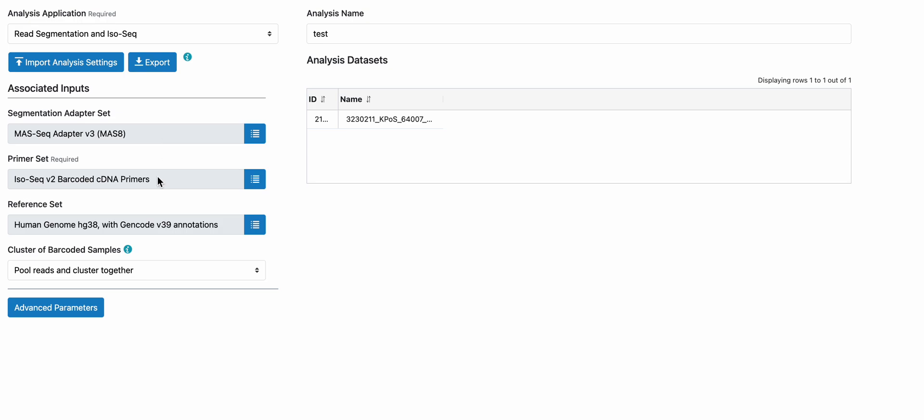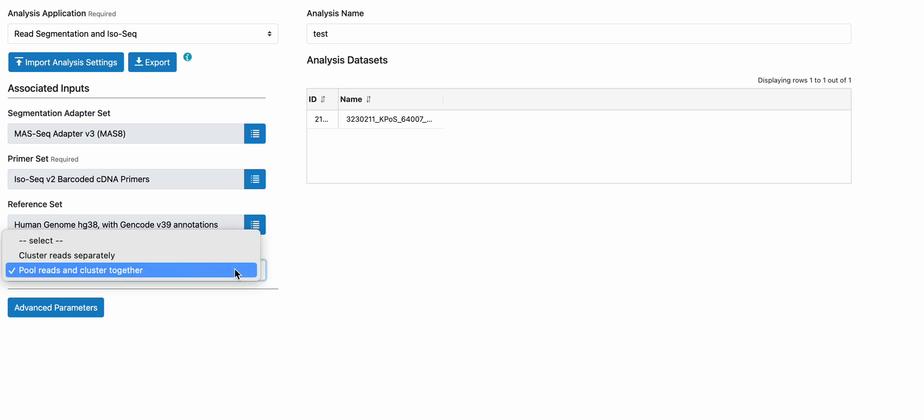There are two options you can choose for cluster of barcoded samples. The two options are cluster reads separately or pull reads and cluster together.